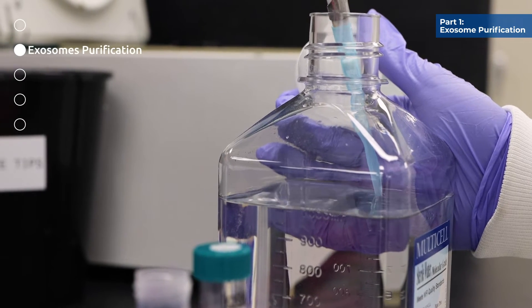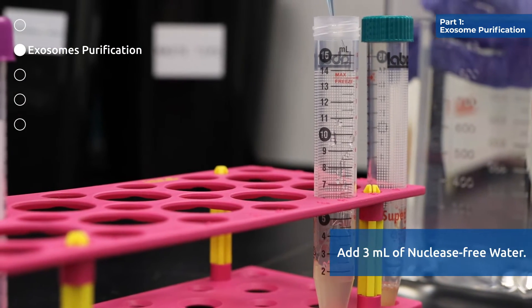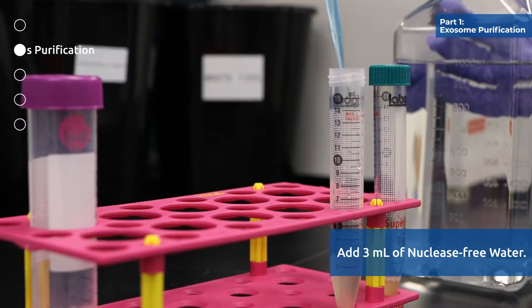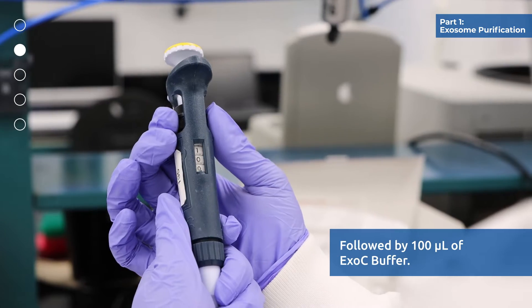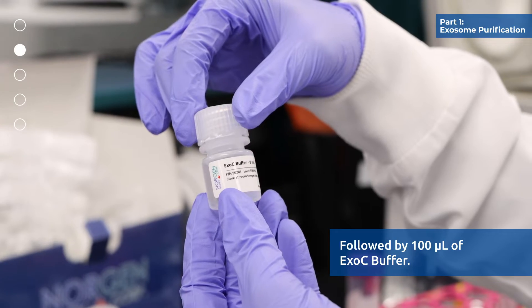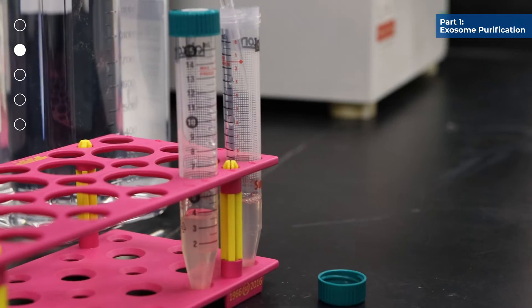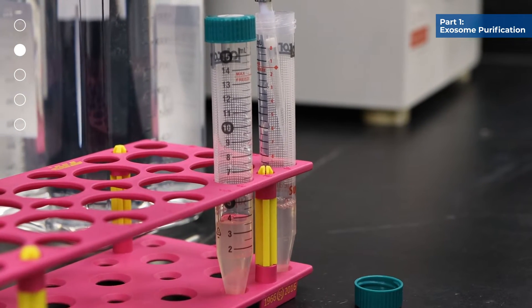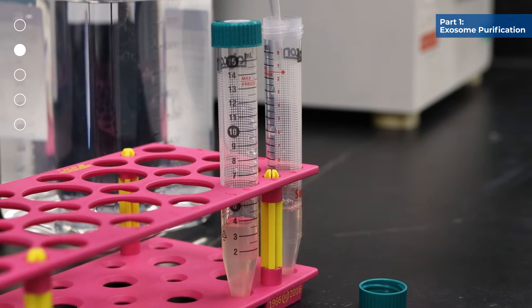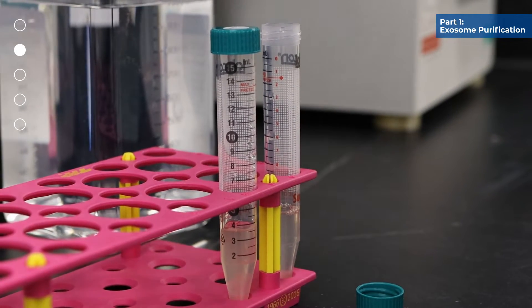To 1 ml plasma serum, add 3 ml of nuclease-free water, followed by the addition of 100 microliters of exo C buffer. Note that the final volume of any plasma serum sample to be processed should be 4 ml before the addition of the specified 100 microliters of exo C buffer.